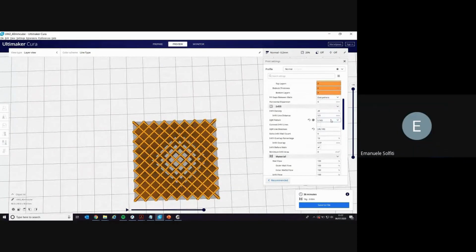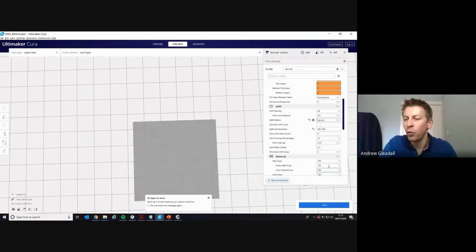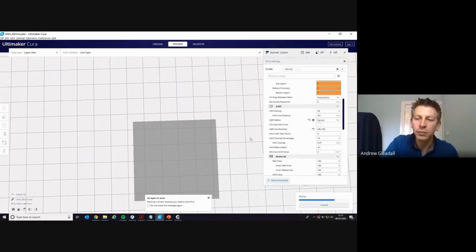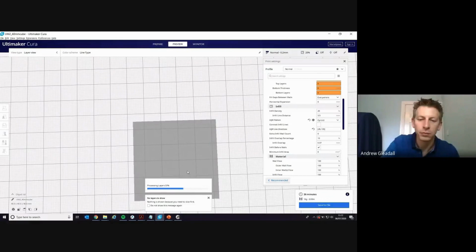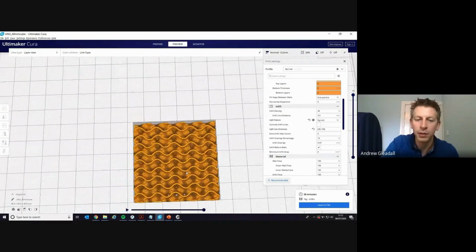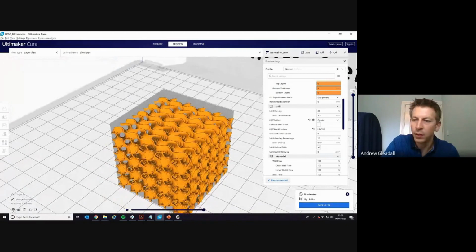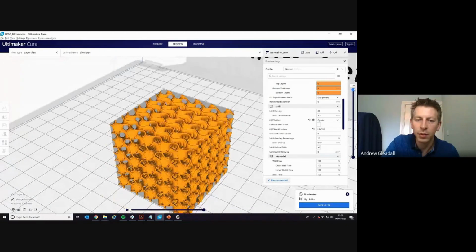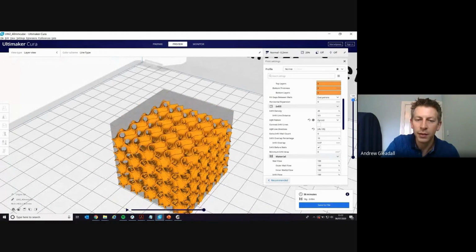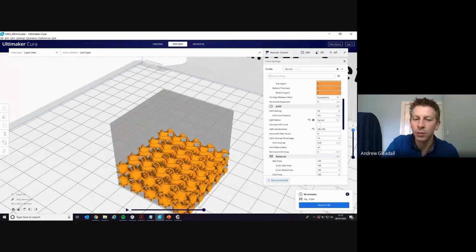So this is using a lines infill pattern. There are all of these different ones. So a gyroid's quite a nice one to visualize. So for this one, each layer is changing in this way. Let me get you a better angle. As I come down through the layers, you can see how each layer is printed slightly different, and it gets this nice gyroid geometry at the end.